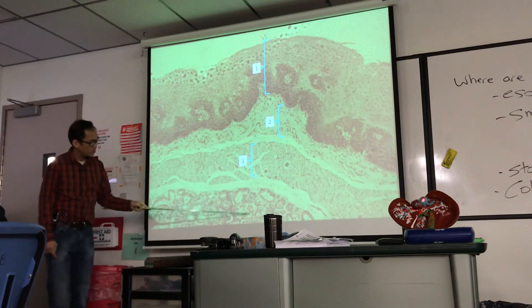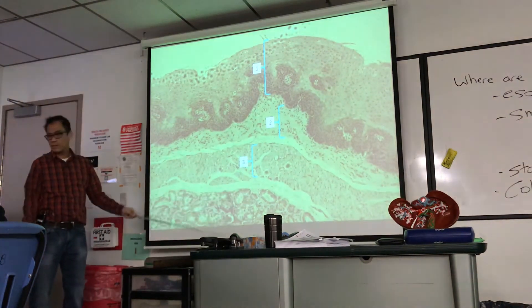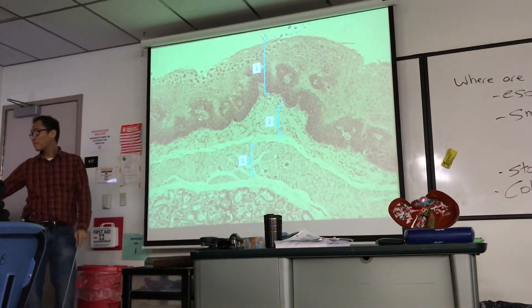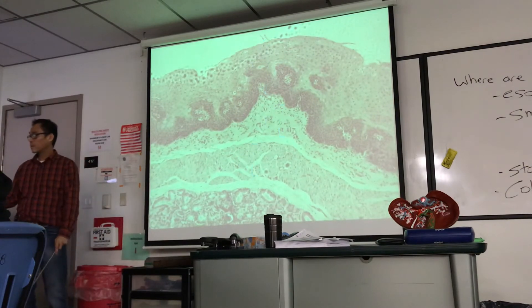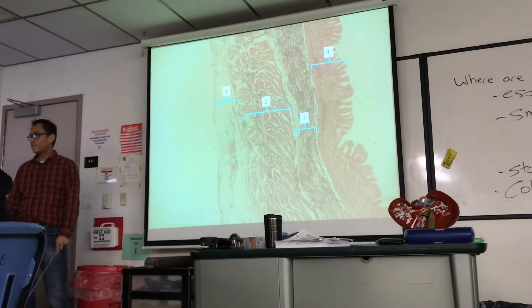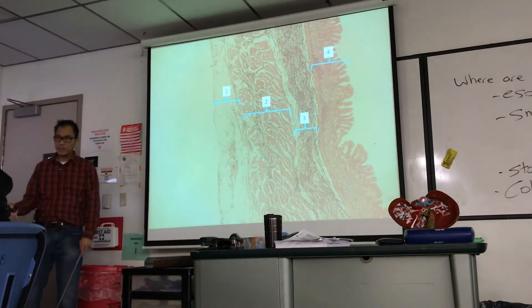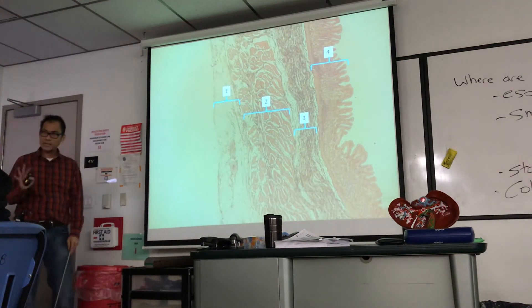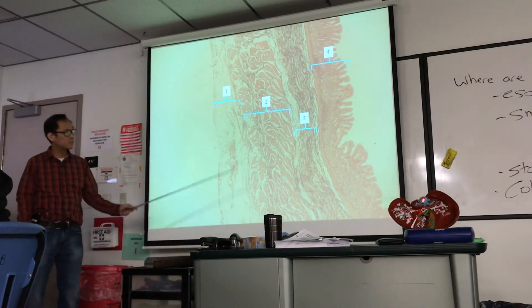This is the esophagus. Moving on from esophagus — there are different parts of the stomach, so these next slides are all stomach. This is stomach; that's where we are in the digestive tract.